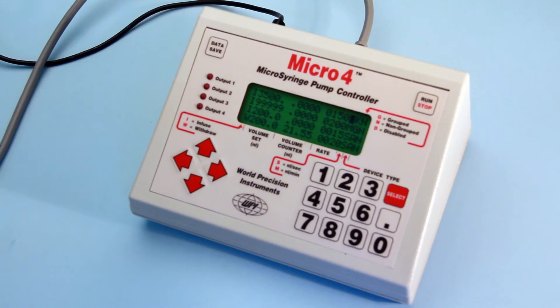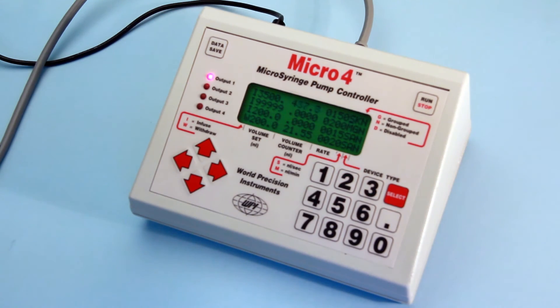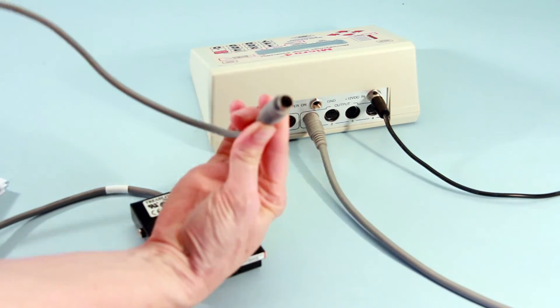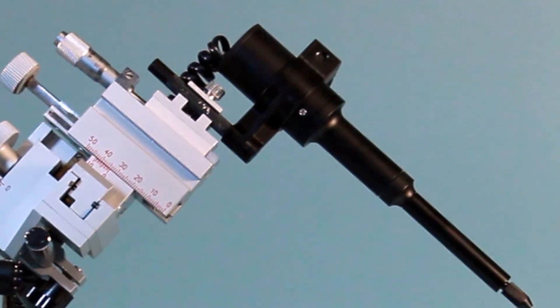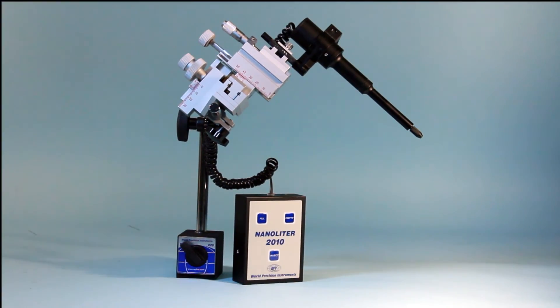Your parameters can be stored in the device's memory for instant recall when the unit is powered on. An optional foot switch can be plugged into a connector on the rear of the controller for hands-free start-stop operation. The Nanoliter 2010 is a robust and economical tool for many micro-injection techniques. Thanks so much for watching — let me know if you have any questions, just give me a call.